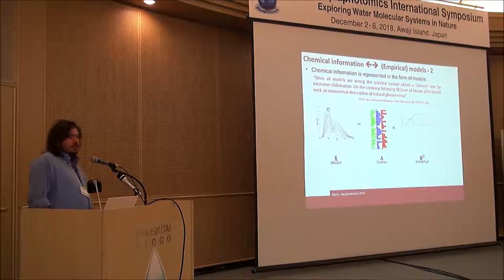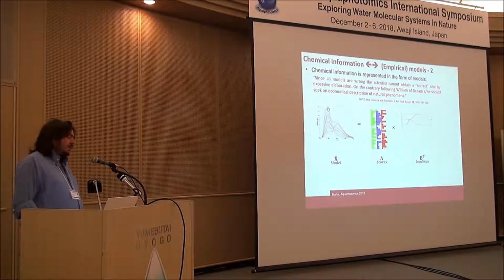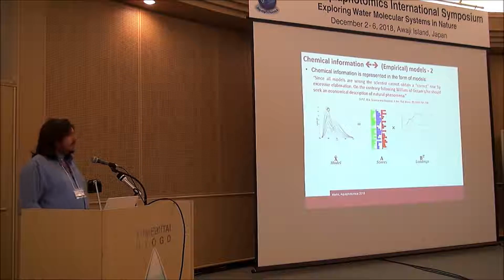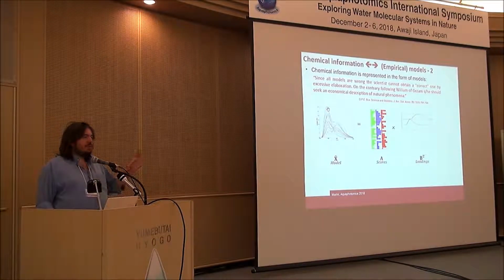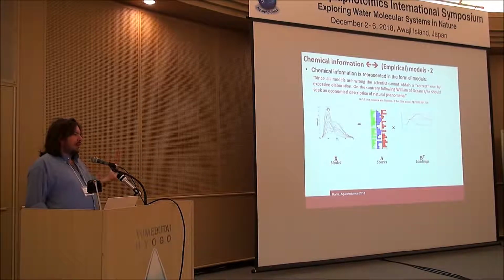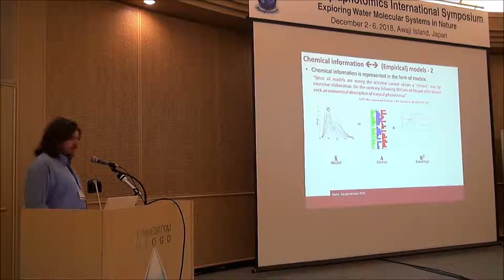And the advantage is that in general, not always, but in general, when we are dealing with spectroscopic data, the models that we favor are so-called bilinear models. Bilinear models help us to summarize the main sources of variation within the data into a set of profiles that we associate to some phenomena responsible for the observed variance within the data, and relative amounts, or scores, that we use for describing how much of that variation is present in the different samples that we are measuring.